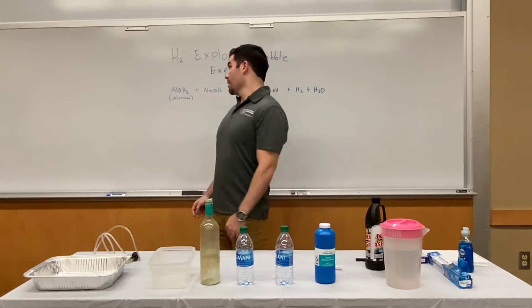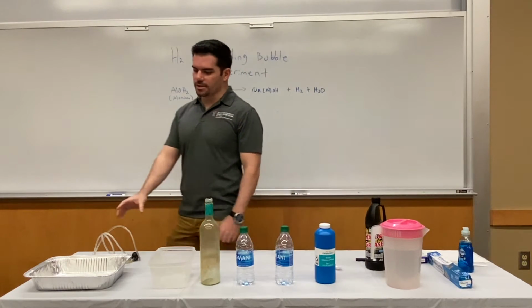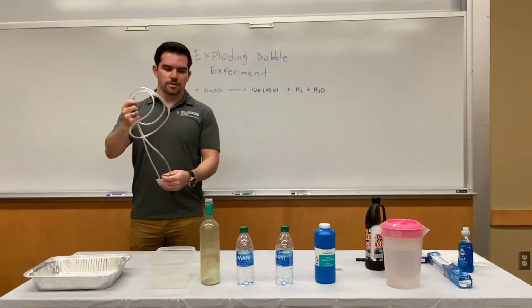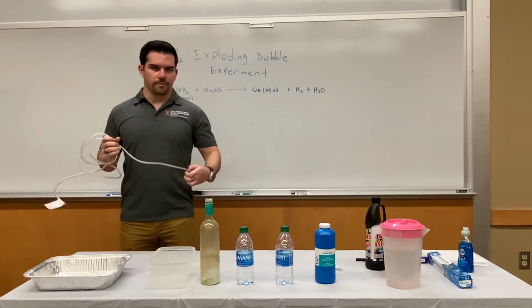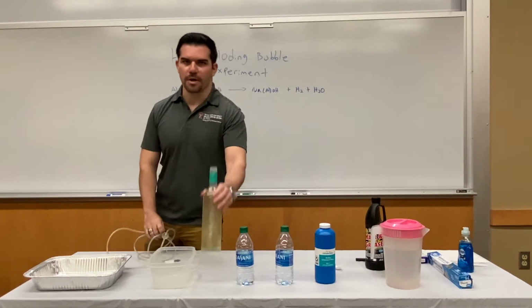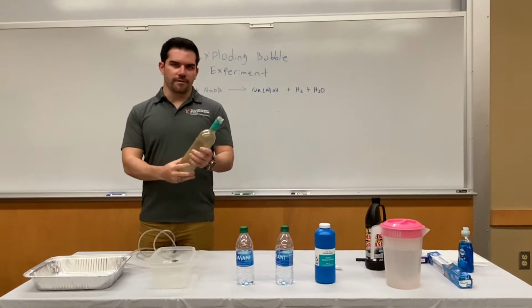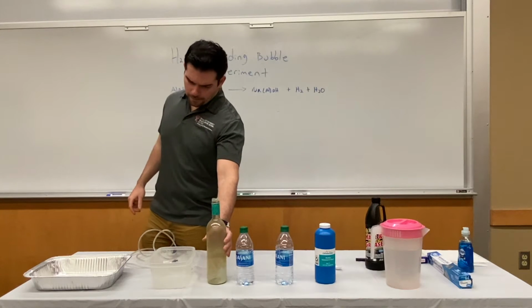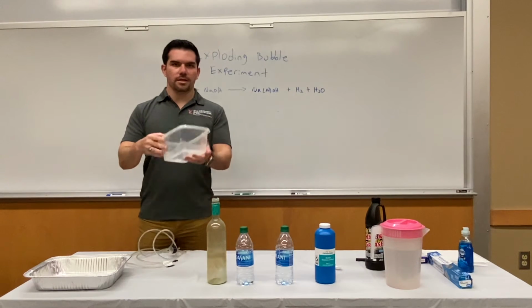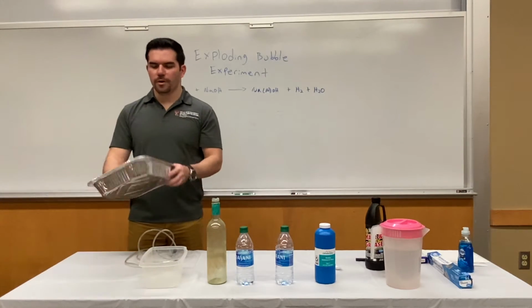Today I'm doing a hydrogen exploding bubble experiment. So the materials you will need is a plastic tubing so you can put it on your glass container. Now the size of the glass container doesn't matter. It could be this size, or as long as it's 250 milliliters and above, it's fine. You will need a plastic container here to pour water, also a foil pan.